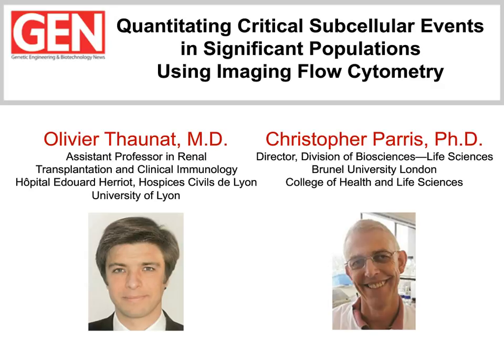Our first speaker today will be Olivier Thaunat, Assistant Professor at the Edouard Herriot Hospital within the University of Lyon. Dr. Thaunat will describe his work on identifying the polarized distribution of antigens on B cells in vivo using imaging flow cytometry. Our second presentation will be given by Christopher Parris, Senior Lecturer and Director of the Biosciences Division in the College of Health and Life Sciences at Brunel University, London. Dr. Parris will outline how he utilizes specific features of imaging flow cytometry for the quantitation of DNA-damaged cells, providing a high-throughput method for the detection of gamma H2AX foci.